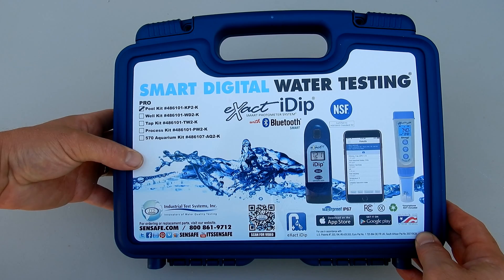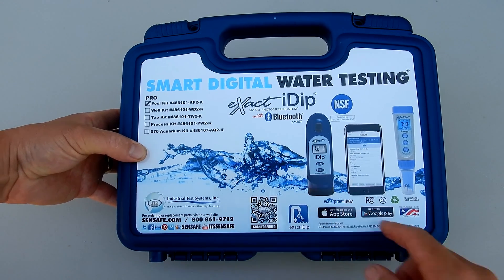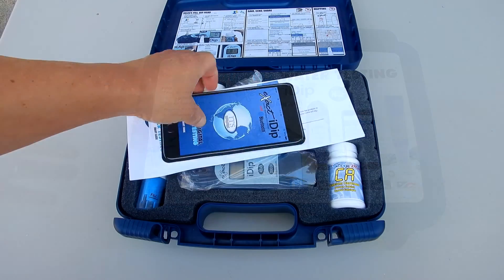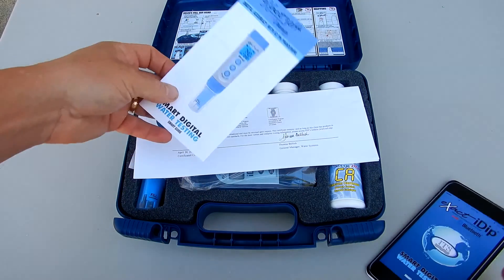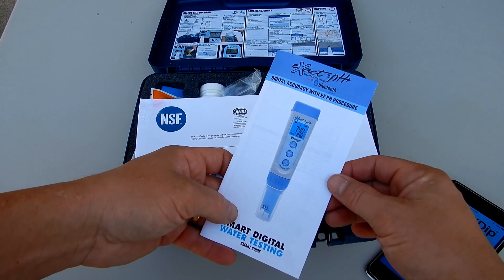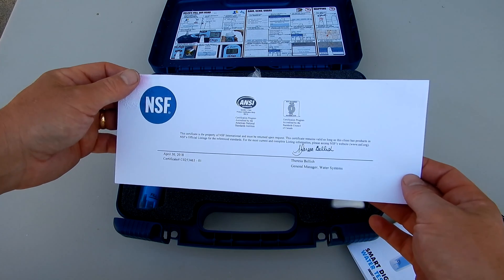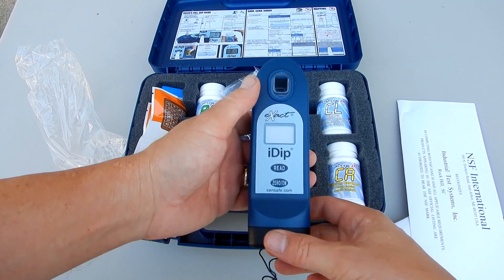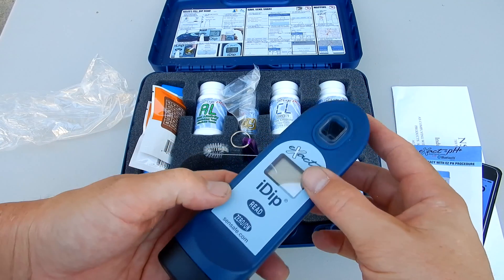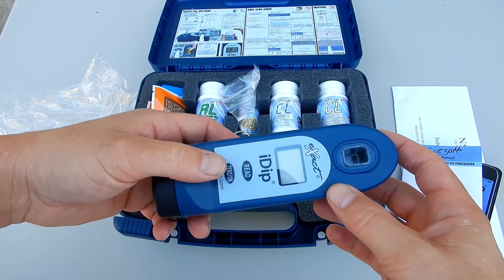In this video I'm going to show you the Smart Digital Water Testing Exact iDip by ITS. Let me show you what comes in the Pro Kit and also what each one of these testers can do. Inside the kit is the manual for the Exact iDip. We also have the manual for the Exact PH Plus. We have the NSF Certification, which means that this product has been certified for commercial use. And here is the Exact iDip Photometer — a waterproof photometer that does many test factors. I'll go over the test factors later in this video.